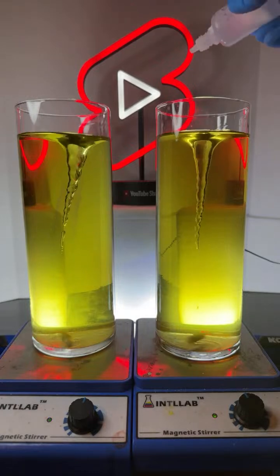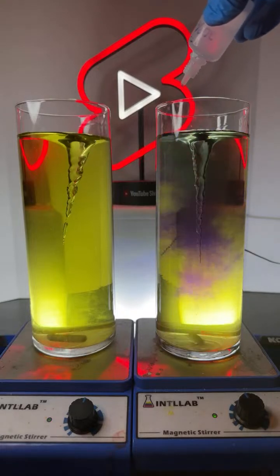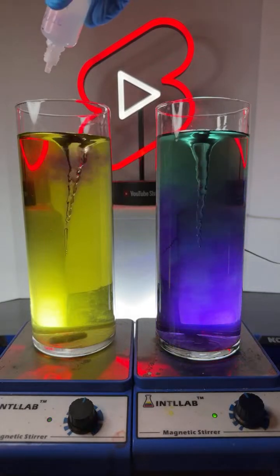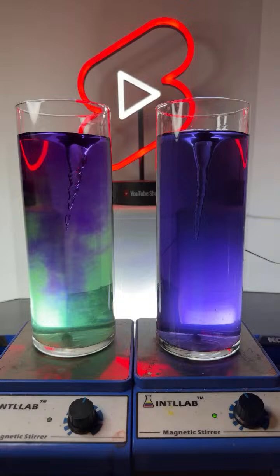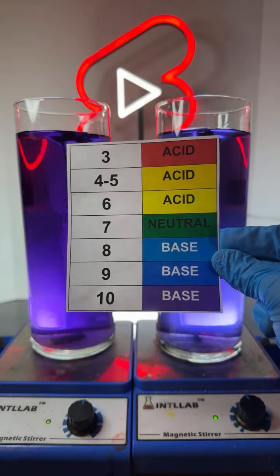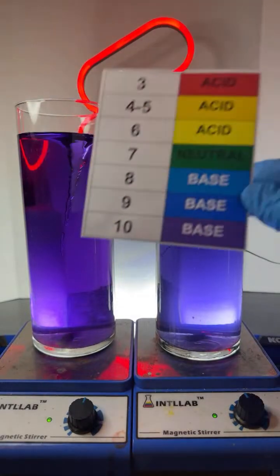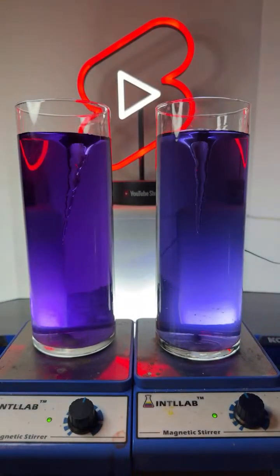So yeah, if you're new to the live, I've got some universal indicator in both of these flasks. Universal indicator is also known as rainbow indicator. Thank you there, King Jacks. I appreciate that. Rainbow indicator or universal indicator displays a bunch of different colors at different pH values. How you doing there, AK? And so these are the colors that universal indicator will display at the different pH values. So right now you can see that's like a bluish violet over here and a violet over here. So our pH is pretty high, right? 9 or 10. Watch what happens when I add some acid to the flask.